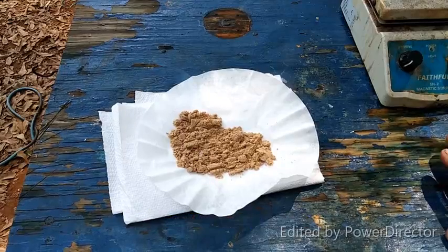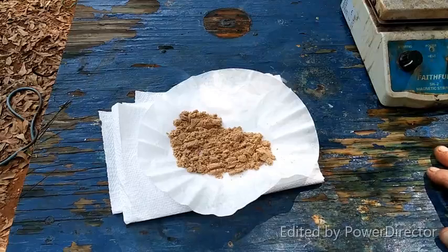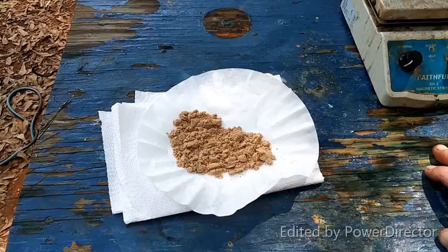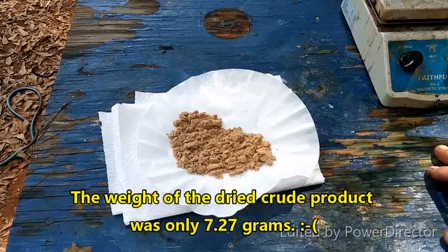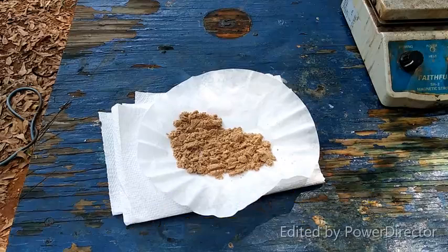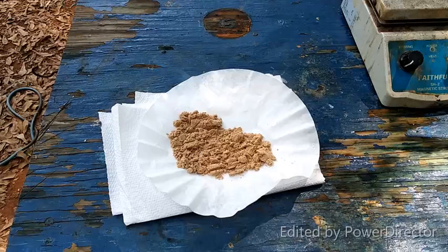But the protocol that I've been working from says that this can be recrystallized from boiling water, so that's exactly what I'm going to do. I'm going to dry this out, get a good weight on it, and then I will recrystallize it and see if I can get something that looks a little better than this. So for now, we're not calling this the final product, we're calling this the crude product, because yeah, that looks pretty crude. But anyway, we'll see what the rest of it looks like later.